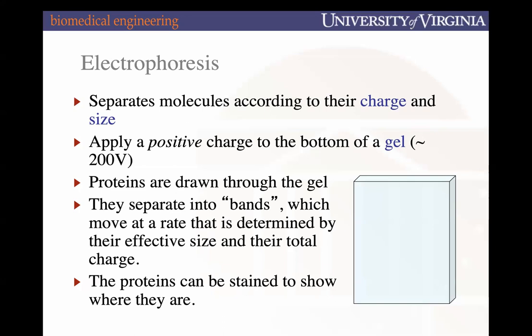That's what defines a gel here. There's a polymer network with a porosity that enables our proteins to move through. Altering that porosity is pretty key for how proteins can move through the gel, through that polymer network. And it's in an aqueous environment.